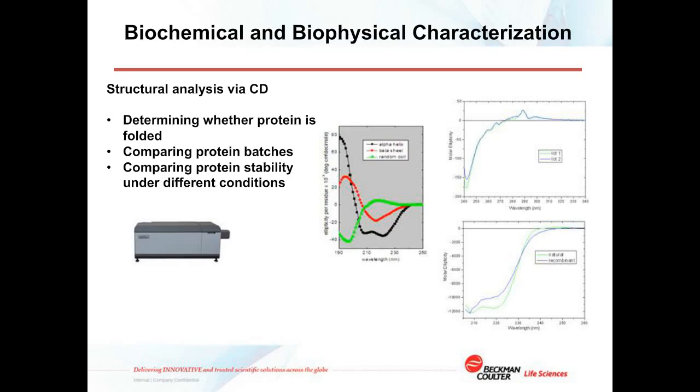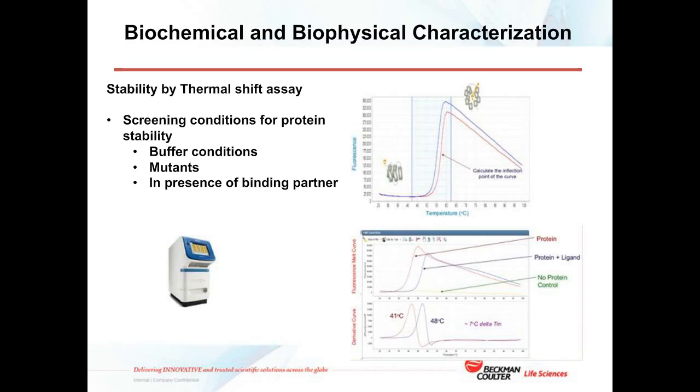It's difficult to know exactly what the difference is, but it ultimately is a different reflection of the ability of the protein to absorb left and right polarized light, and the alpha helices, the beta sheets, etc., given their asymmetry, will absorb right and left-handed light in a different manner. And if you compare batches of proteins in time, you will be able to see that they're either the same or different depending on their ability to rotate the light using circular dichroism.